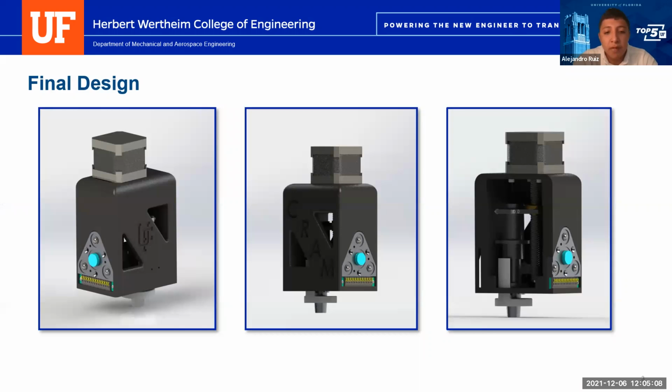These are 3 renders of our final design. In the first picture, you can see an isometric view of the full system, as well as in the second render. And in the third render, there's an extruded cut showing the internal parts of the design.